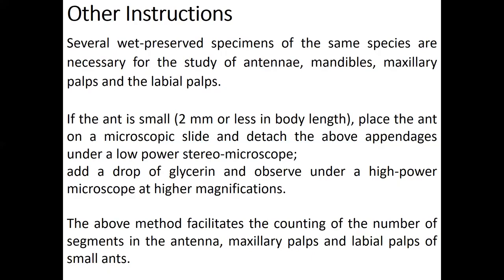Sometimes you have to look at the mandibular teeth, like there can be processes, sort of projections, spiny teeth-like projections on mandibles. So in classification to the genus or species level, this is very important.